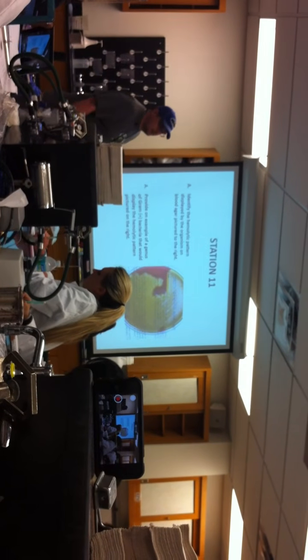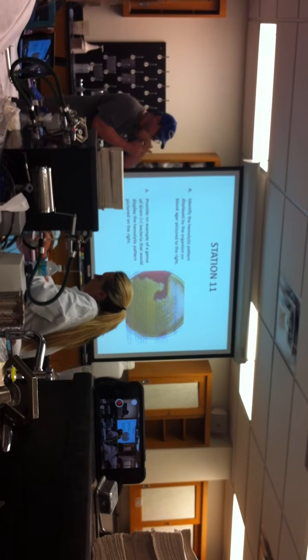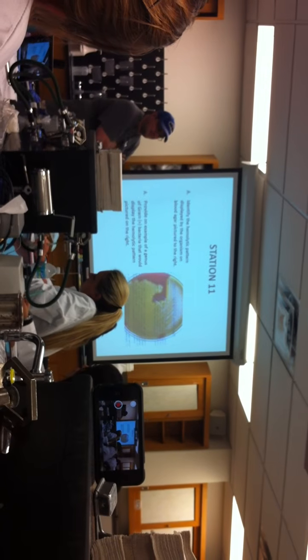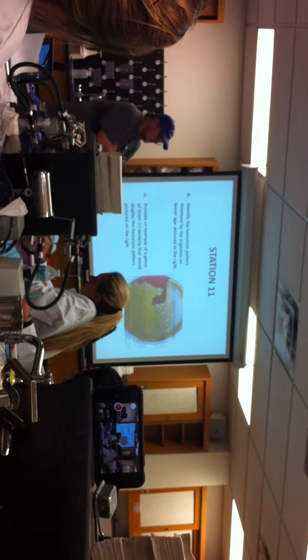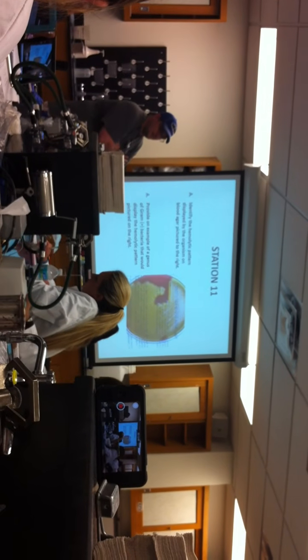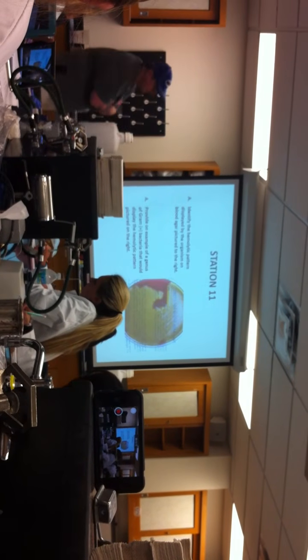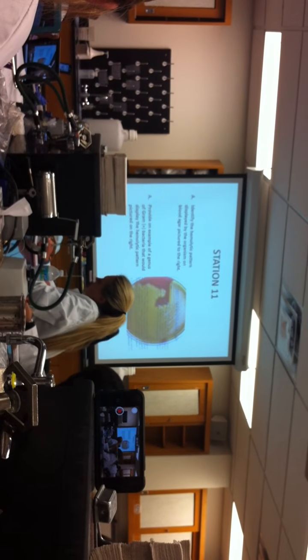What kind of organism can do beta hemolysis? You should know too. Streptococcus. Streptococcus pyogenes is a great example. What's another? What's another bacteria that causes impetigo? Staph aureus. Staphylococcus aureus, or Streptococcus pyogenes. These are great examples. All right.